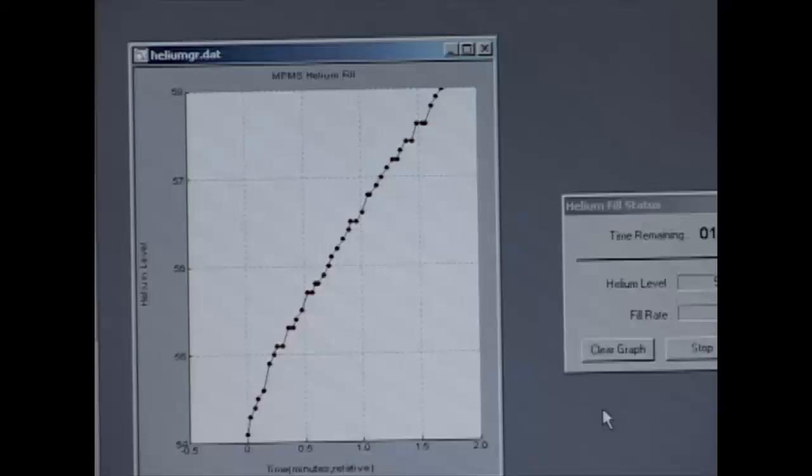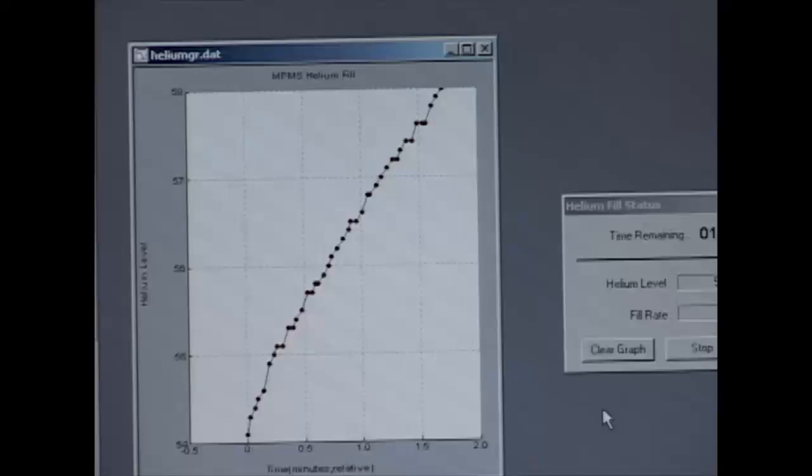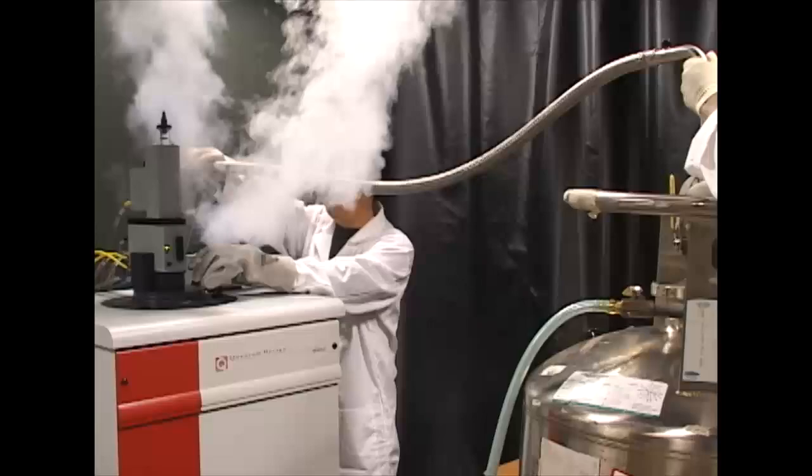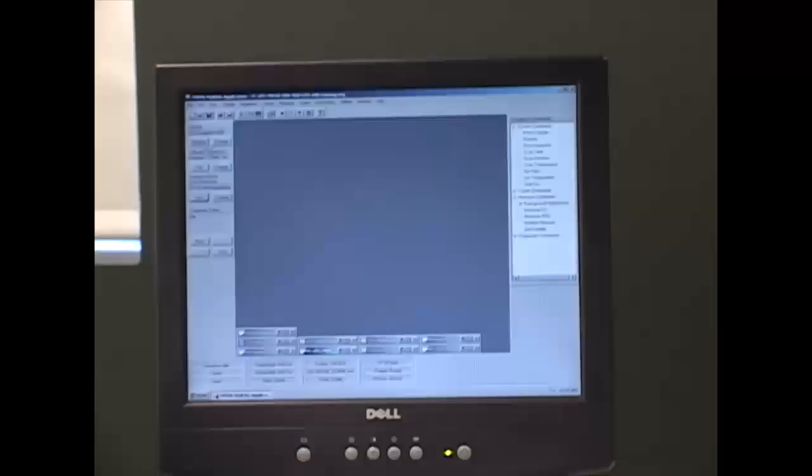The computer reports the progress of the filling. The rate should be slow at about 2.5 percent per minute and it is filled to 90 percent. To contain the helium a positive gas pressure is applied from the external tank.